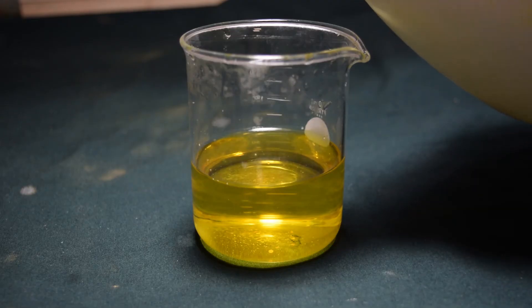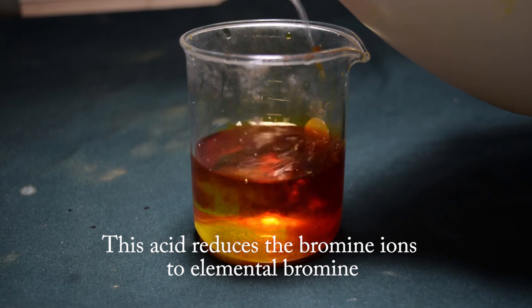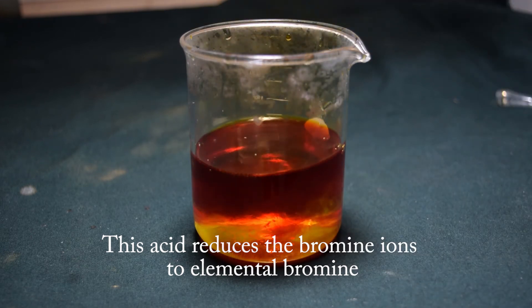Something interesting to do is add a little hydrochloric acid to this sodium hypobromite. As you can see, it converts it right back into elemental bromine.